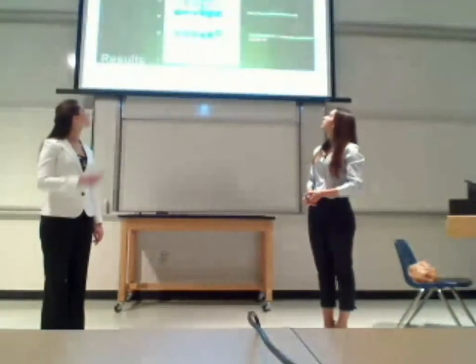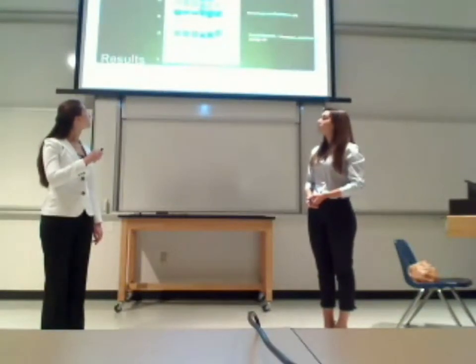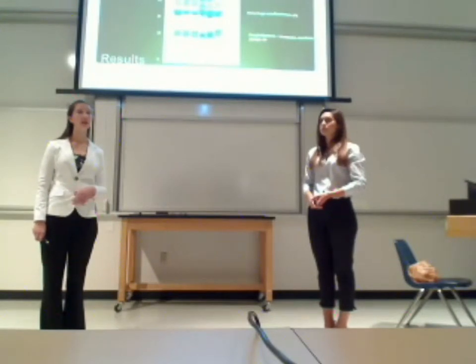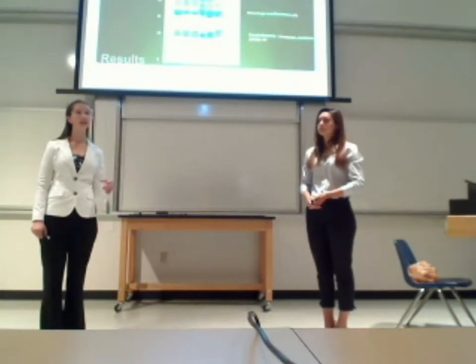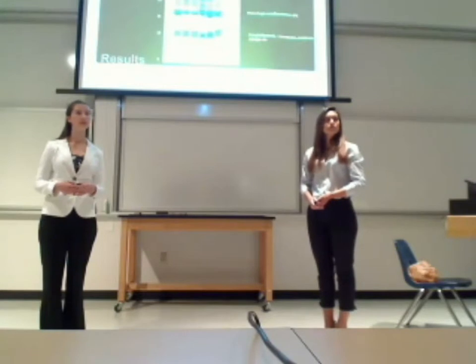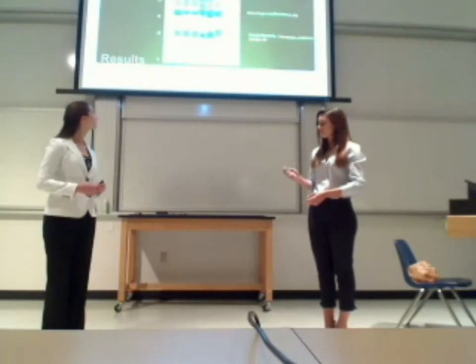Something to point out is that there is a bit of a difference between each of these, and that's because venom is very, very complex, and it can change in individuals from the same species, and it can even change within one individual throughout its entire lifetime. So it really depends on which snake you're testing. In order to get more accurate results, we pooled our venom, so we took it from several different individuals.